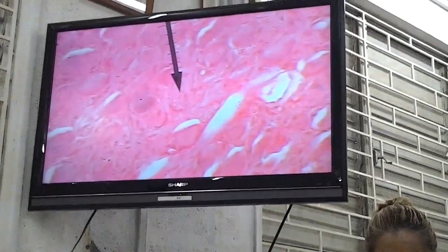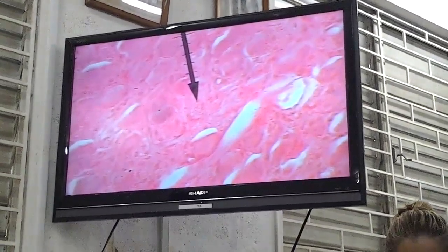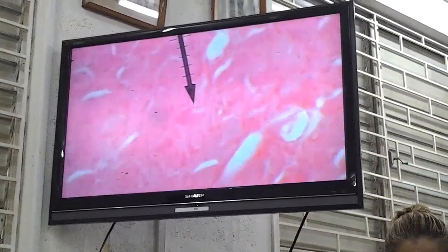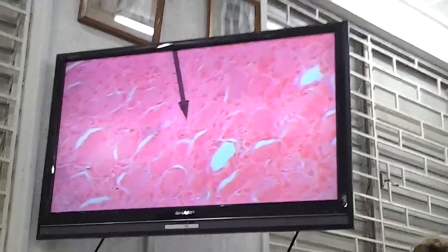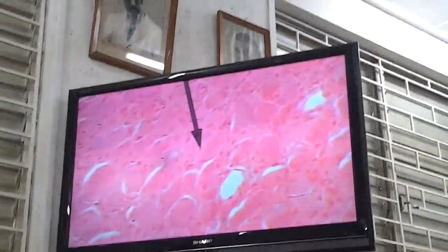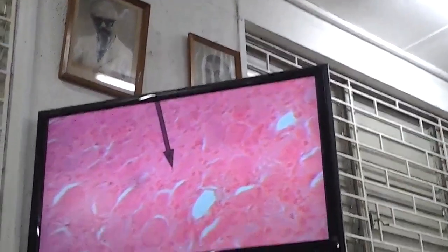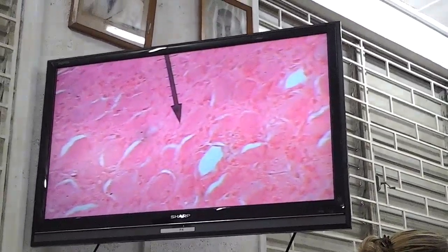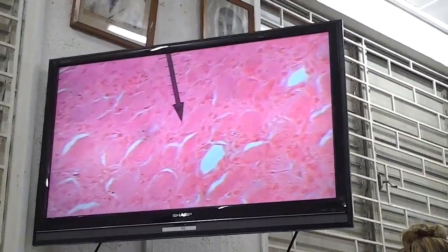We know that this is coming from neural crest tissue, alright, so ectodermal in origin from neuroectoderm. Okay. And we see here these cells, and these cells are always coming in the exam. So the nuclei of them, they're flattened cells that surround the cell bodies, and these are referred to as satellite cells. Okay. So these are the satellite cells.